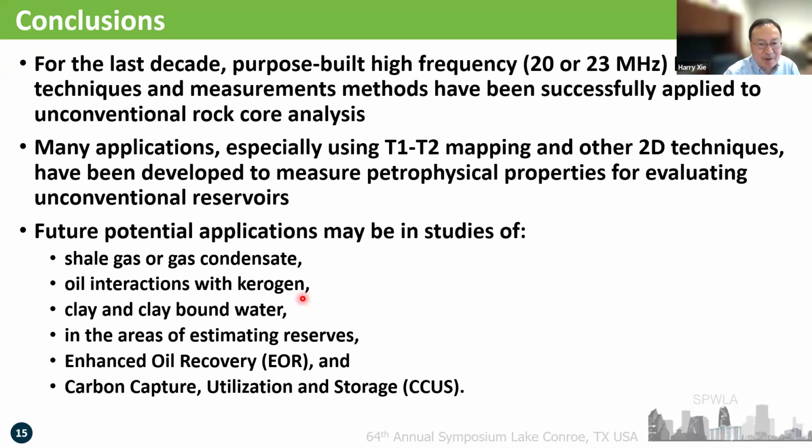Or if you saturate with brine, do you get the same saturations? You have to understand that. And especially another part is clay and clay-bound water. That's the most important part, and this is a tricky part as well. So we need to have an NMR method to look into that.